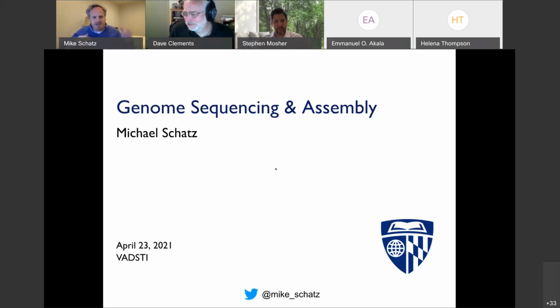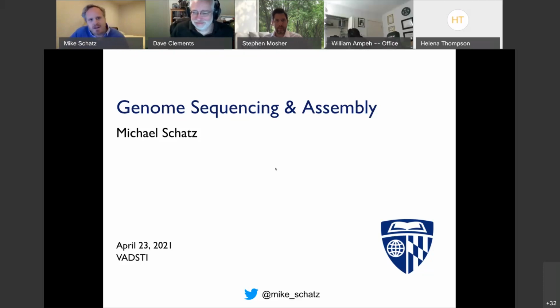There's a process where we take these individual reads and stitch them together. That's a problem called de novo genome assembly. So I'll be talking a little bit about the sequencing and then how we do assembly to actually reconstruct a genome for further analysis. And then in the exercise, we'll do those steps. We'll also do a bit of gene finding to look for novel genes in this very special strain that we've put together for you.